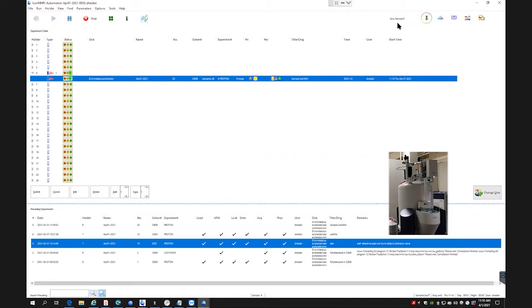And the key here is you want to make sure that you pick your sample holder spot near where the previous sample was, or where it currently is. Otherwise, it's going to take a while to get to that sample because the sample carousel only goes in one direction.